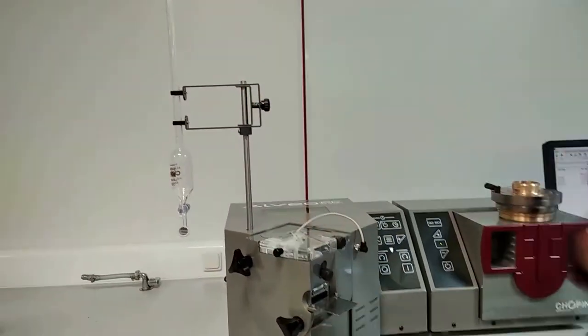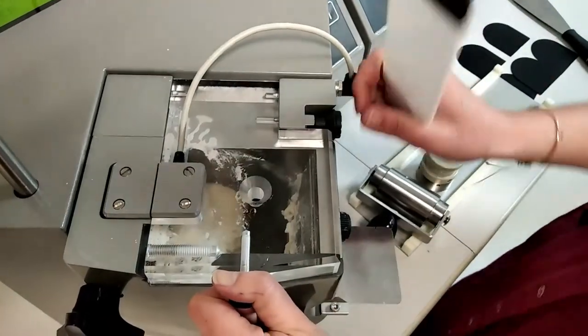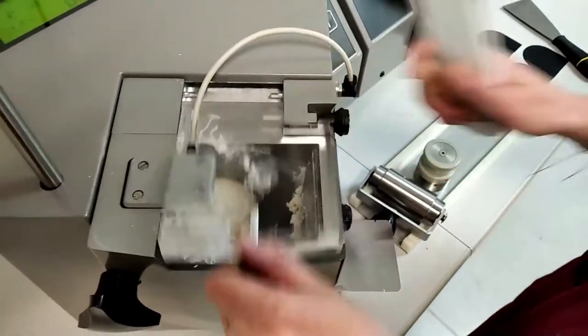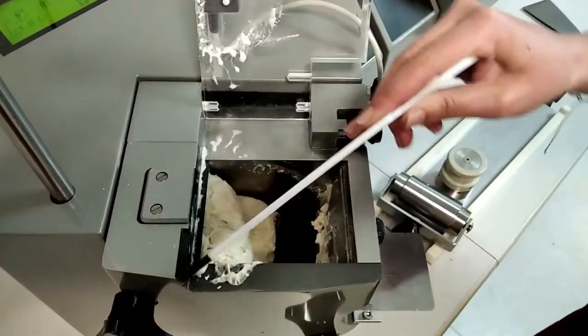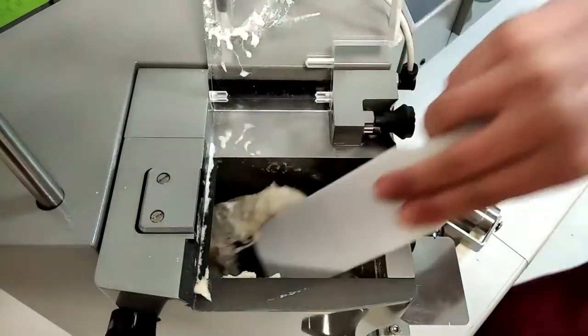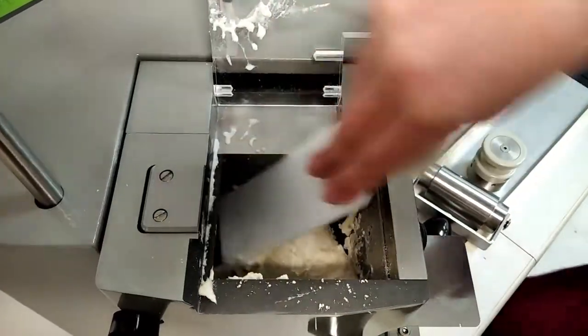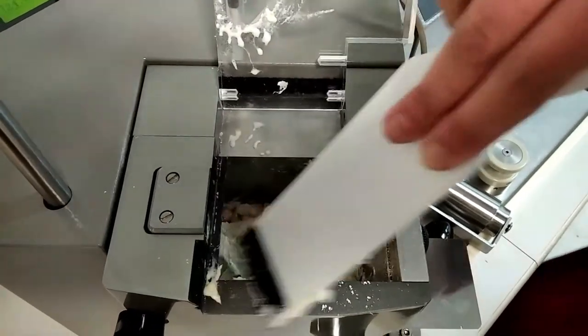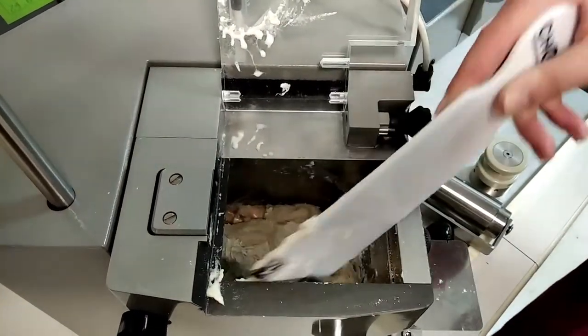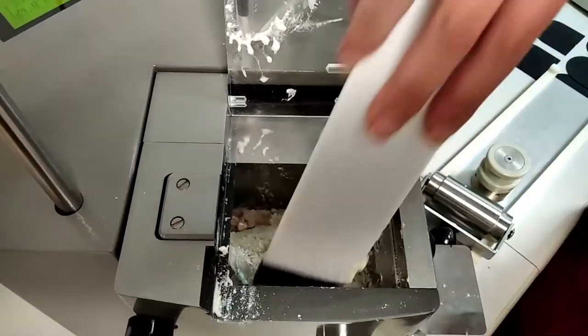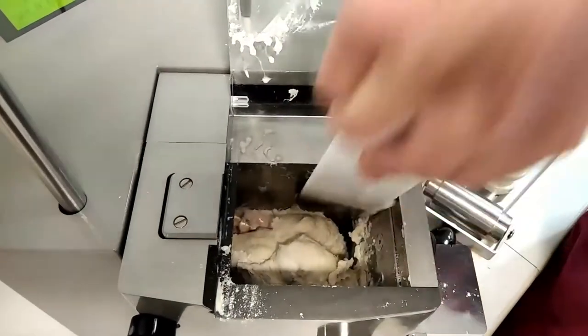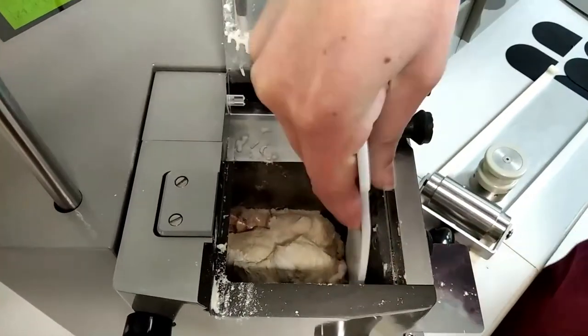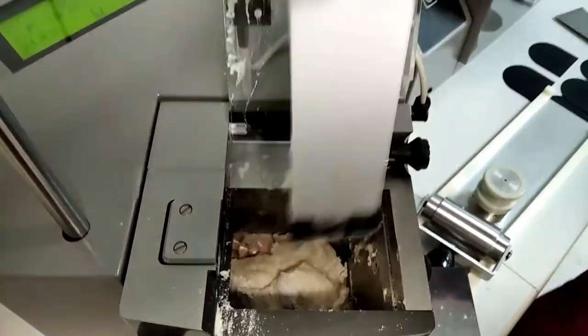Allow the dough to form for one minute then open the cover. Using the plastic spatula provided, reincorporate any flour and dough adhering to the F register and to the corners of the kneading machine. You can repeat this operation 2 or 3 times. This step should take less than 1 minute.